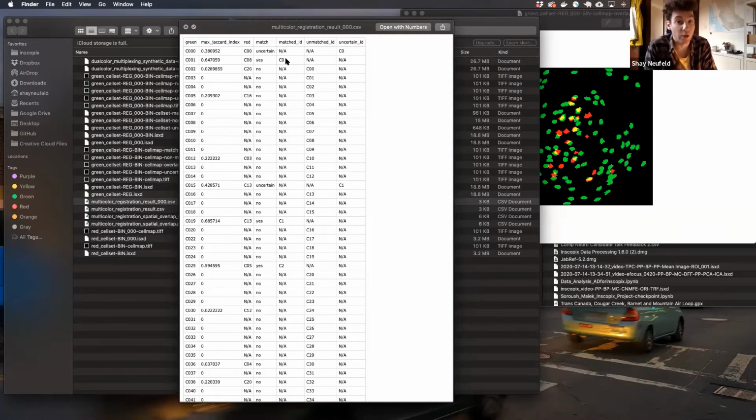Just like how you draw your manual ROIs is also going to affect that. I'm not aware, Bruno, I don't know if you are, or if any of the rest of you are, of a consistent systematic difference between the sizes of PCA-ICA contours and CNMF-E contours. But I don't doubt that they could be different across different data sets.